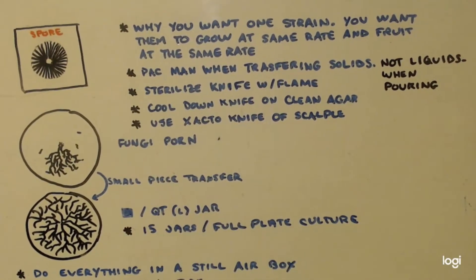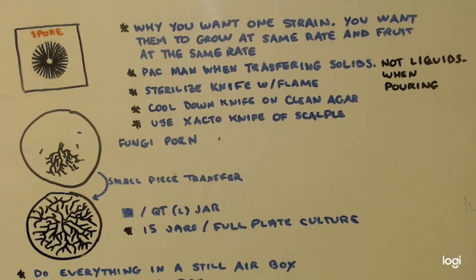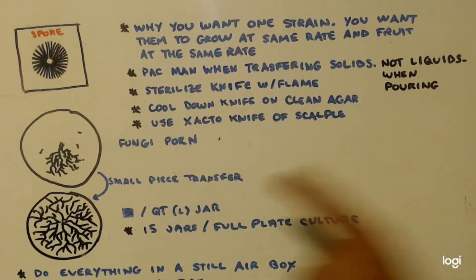We grow out our mycelium and have a nice plate filled up like that. One plate will do like 15 quart jars if you had a full plate of culture. You only want to take a sample about the size of your fingernail and put one sample into each jar. Now, if you have fewer jars, use more pieces — cut up two pieces and throw them into each jar.